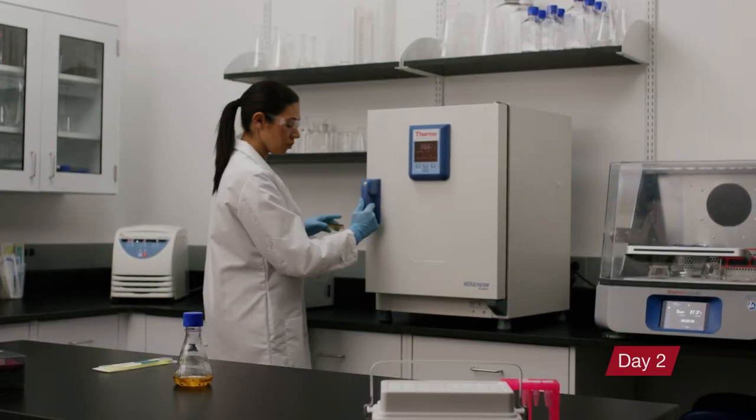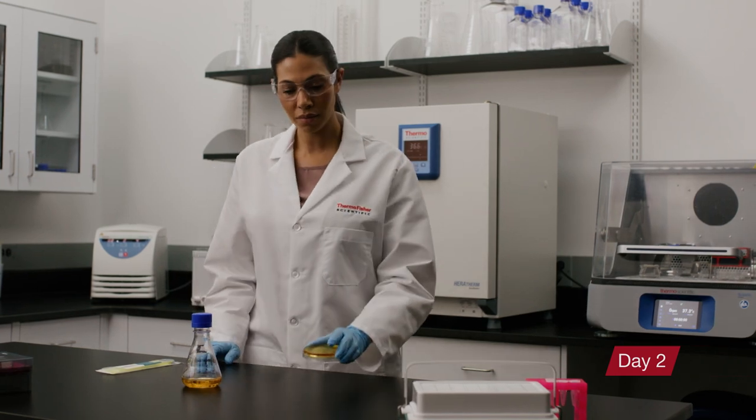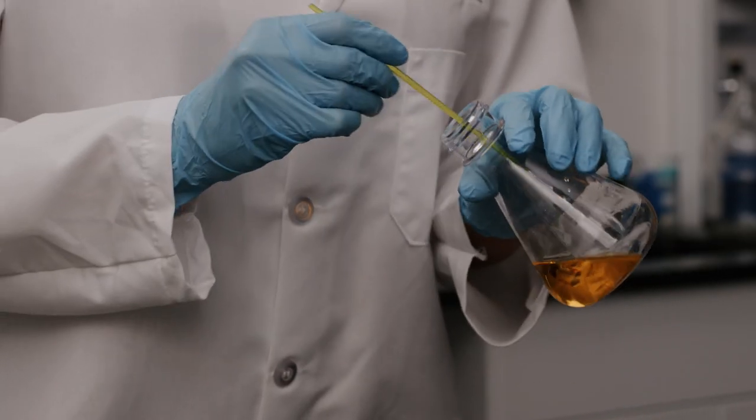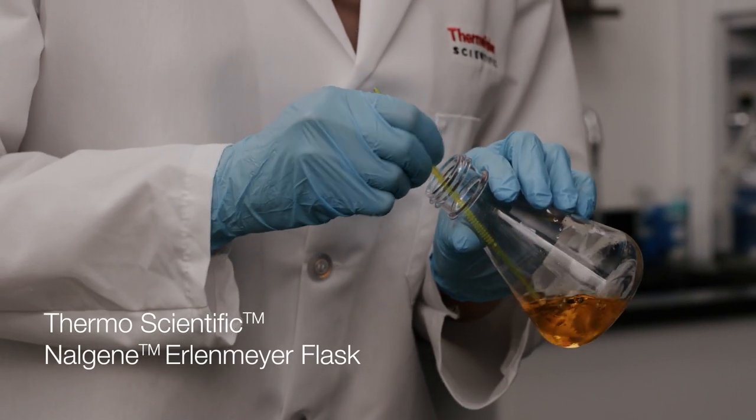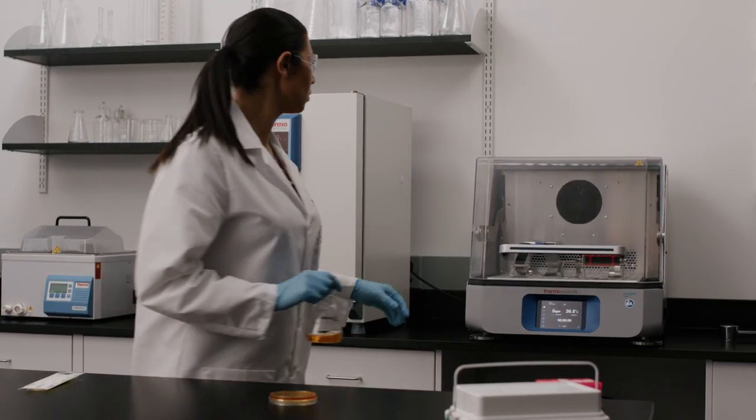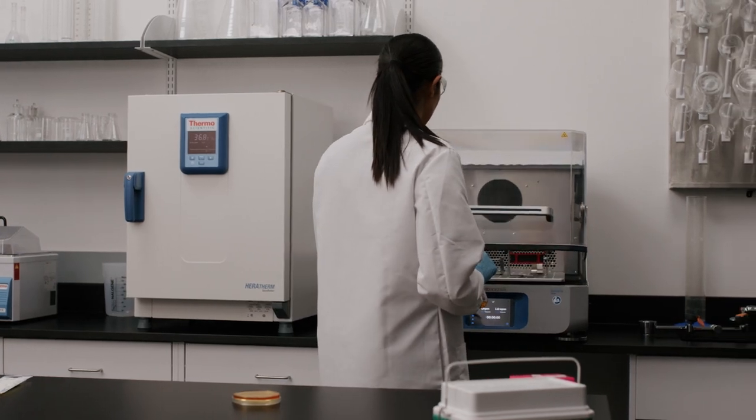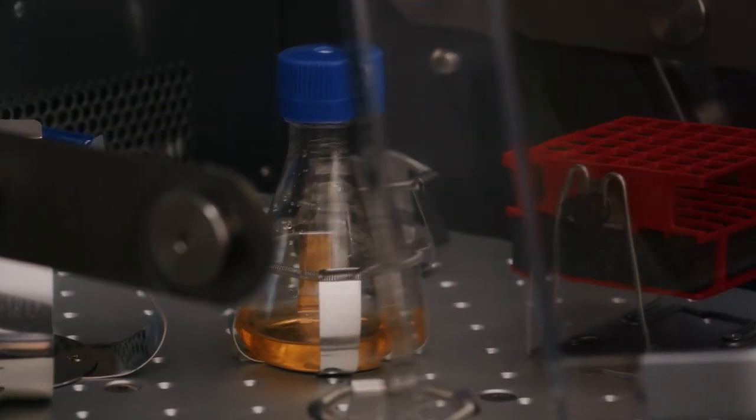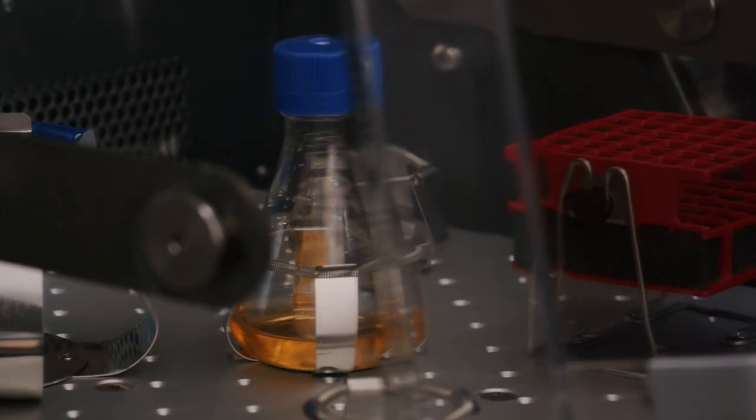The next morning, Maria removes the plate and picks a colony. She puts that colony into more media in a ThermoScientific Nalgene Erlenmeyer flask. Next, she places that flask into the same benchtop shaker she used yesterday. This time, it's set for 37 degrees Celsius for 18 to 24 hours.